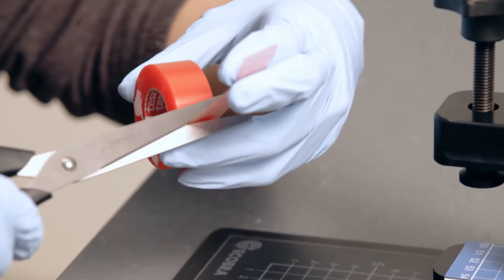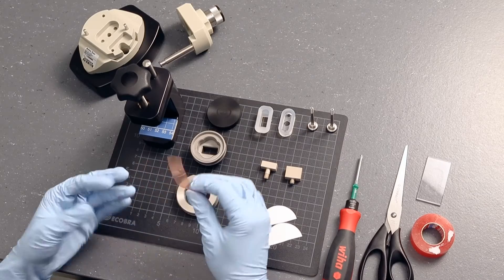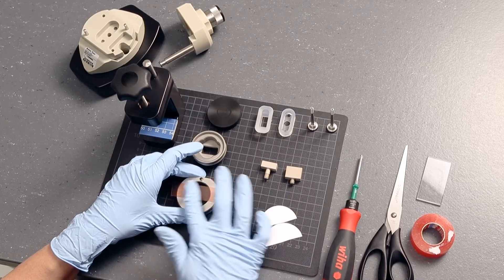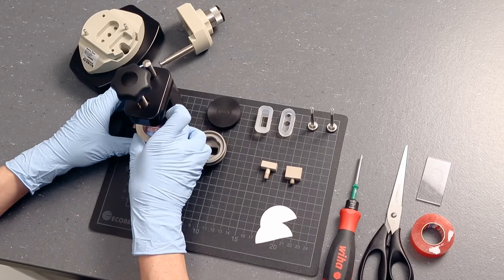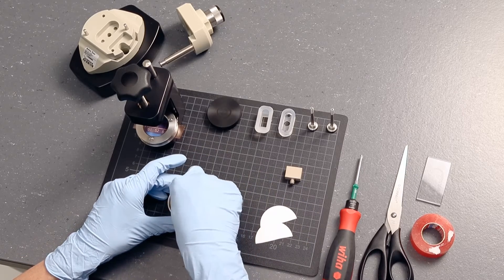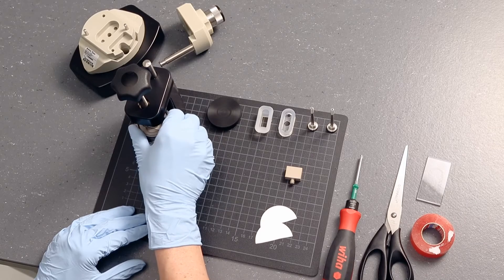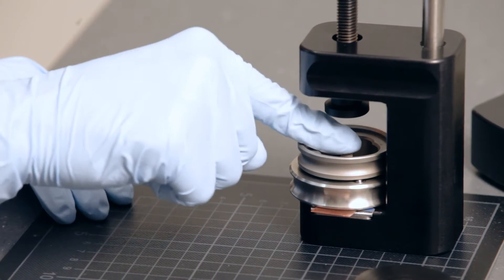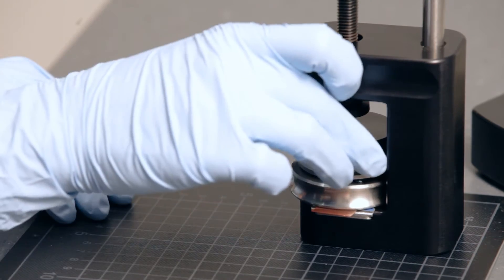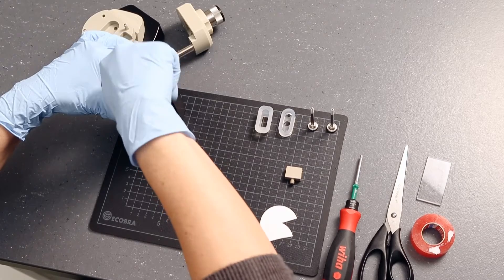Cut out a suitably sized piece of adhesive tape and place it on the bottom of the puncher frame. The sticky side has to point upwards. Prepare the sample holder and the puncher and place it in the frame. Press down the sample holder to ensure good adherence with the tape. Cover the puncher and tighten the knob of the punching tool completely.